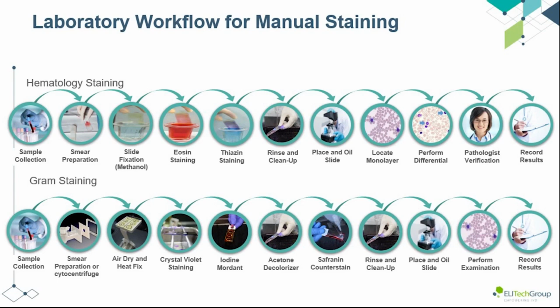Once that counterstain is done, you rinse off the slide, look at it under an oil immersion lens, perform the examination, and get those results sent out to the clinician. Again, how long you leave in the crystal violet and the exact steps for the iodine mordant, as well as acetone and safranin, those all vary depending on the reagents used and your lab's specific workflow.